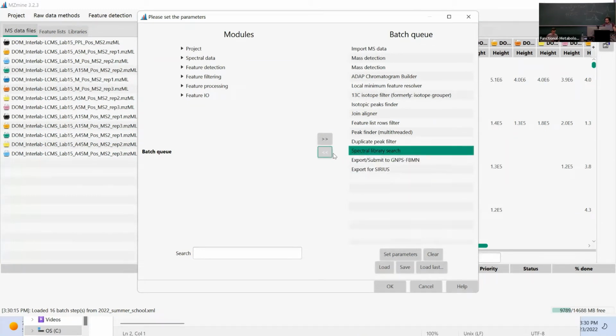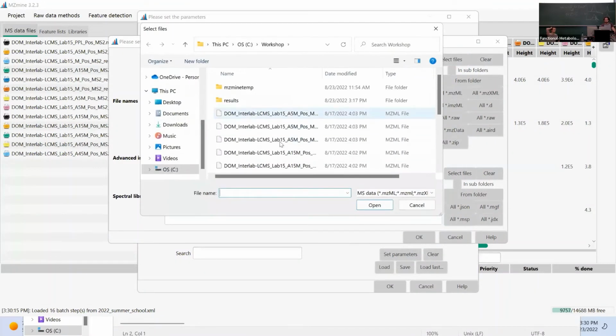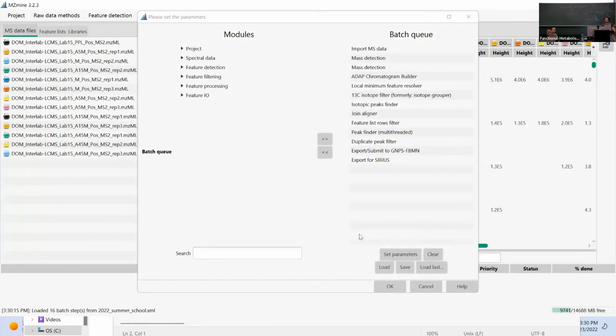I would give the mass detection thresholds a little check, because even though this is all Orbitrap data, within the data sets we selected there might be some tiny differences between the different platforms. That's actually what I already saw. Some people said, but wait a minute, it doesn't look like that for your data set. And it's the task later on, with a similar platform.